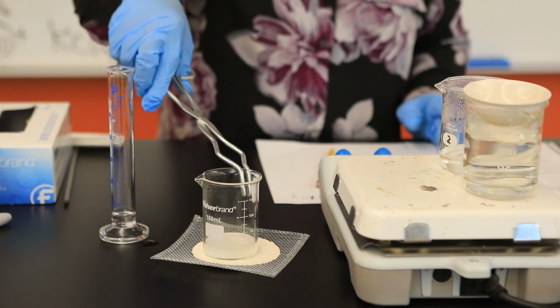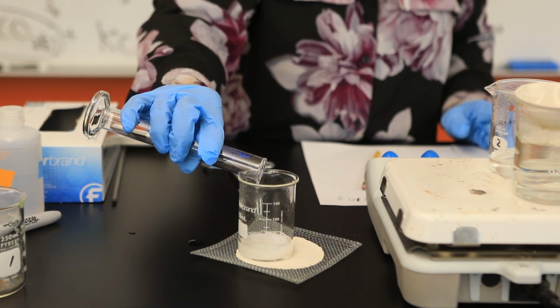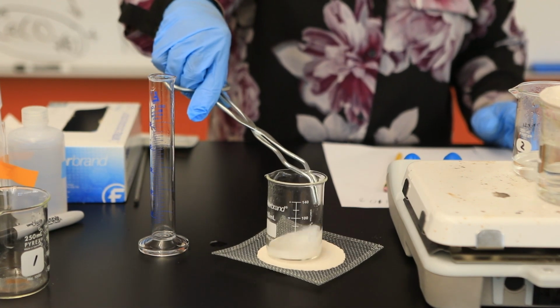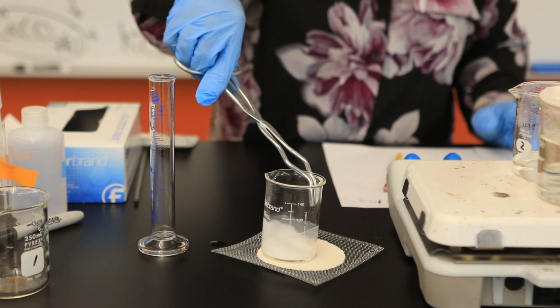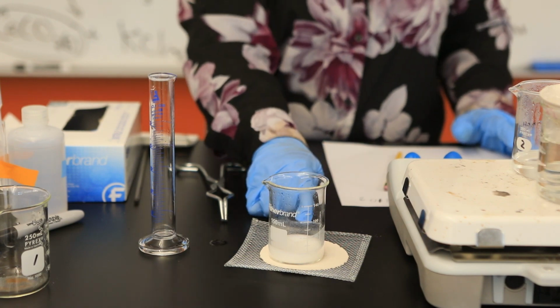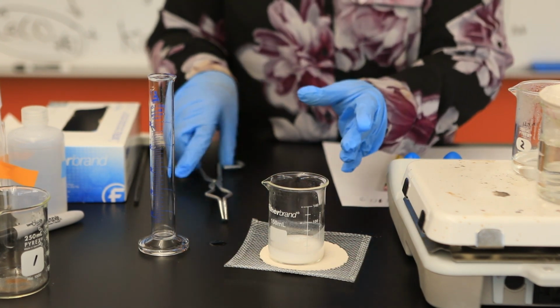So as I'm doing this, I'll take a minute and also just stir my solution along. And so hopefully you observe the formation of that white precipitate of our recovered calcium carbonate. Okay, now, again, this is a wonderful suspension, so I want to make sure that I only obtain just the calcium carbonate solid. So this will again involve an additional filtration step.